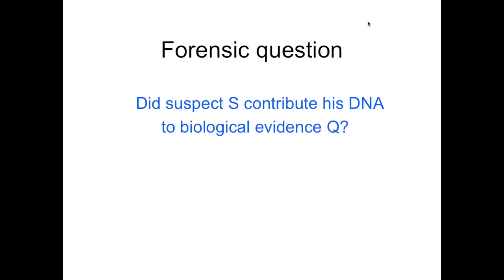The forensic question that we would be asked, or you would be asked, is did suspect S contribute his DNA to the biological evidence Q, the shotgun shells? And I'm going to show you how you would use TrueAllele to answer this question.